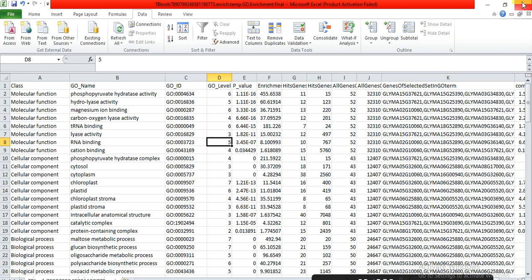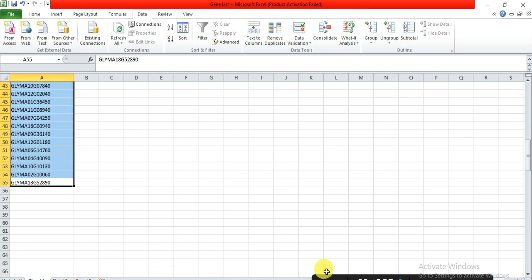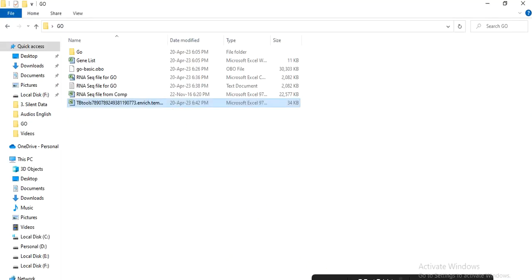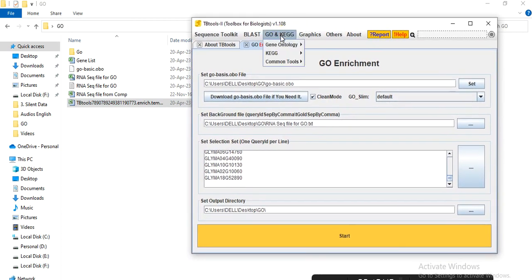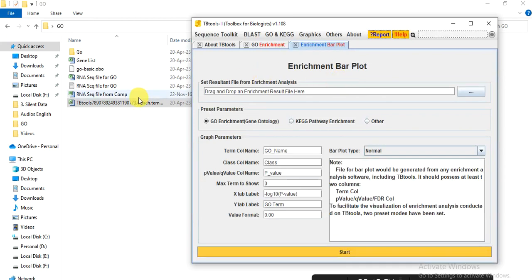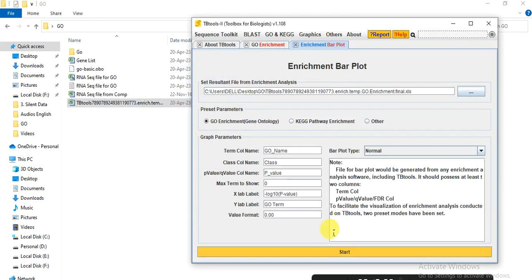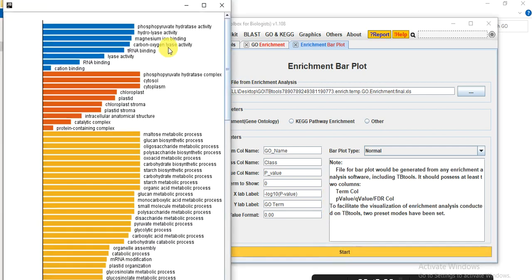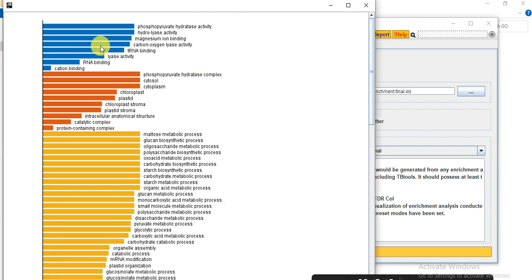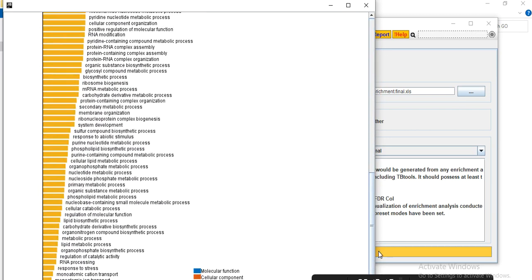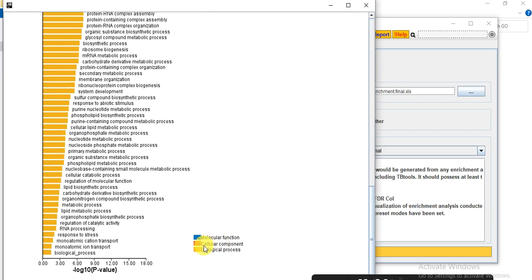Now we can make a graph that represents all these classes. Open the TV tool, go to GO, then Common Tools, then Enrichment Bar Plot, click on it, and drag the GO analysis output file we just generated, then click Start. The figure is generated — blue represents molecular function, red represents cellular component, and yellow represents biological process. The x-axis is based on log10 values and the y-axis shows their descriptions.